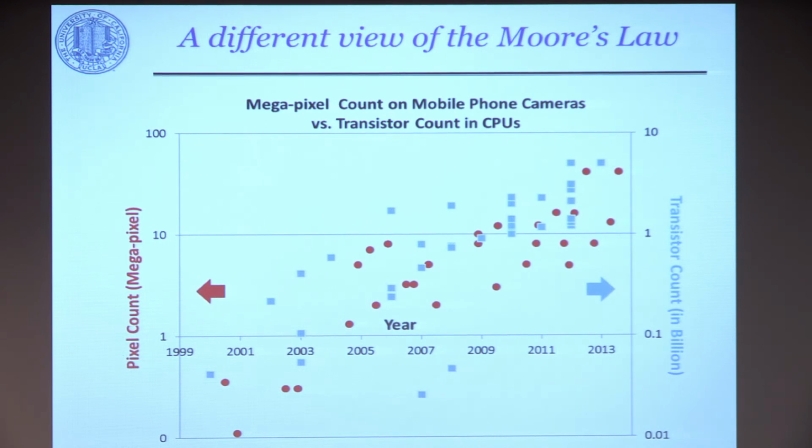So I want to come back to this slide. That's where I started. A lot of what I've shown is literally riding on this curve, rapidly improving its performance every 2 years, maybe doubling its number of pixels, thanks to you and other consumers changing your phones, your consumer devices more frequently. That's the drive for the industry to come up with new designs. We're leveraging it and creating designs or microscopes or sensors that literally improve their performance as fast as this logarithmic curve. This is probably the first time that microscopy is really enjoying Moore's law because of the design simplicity here.